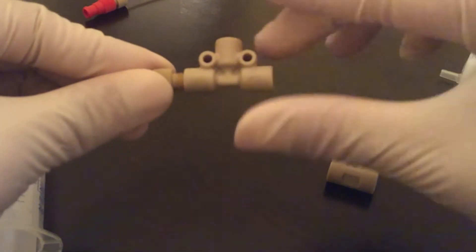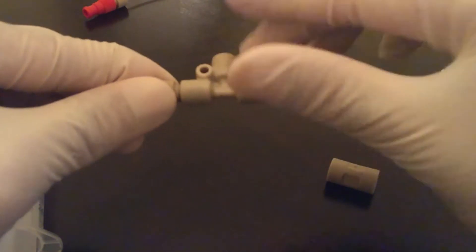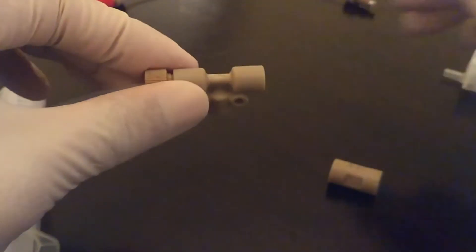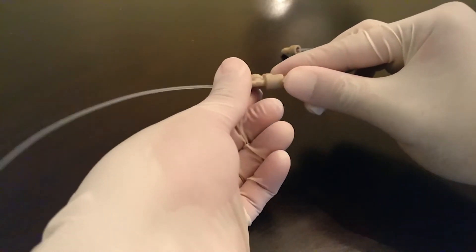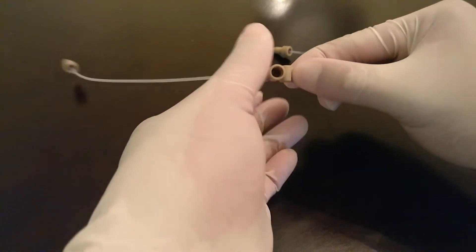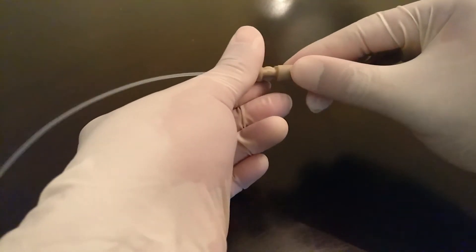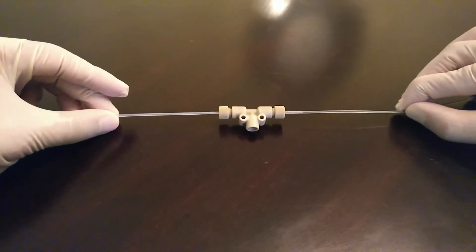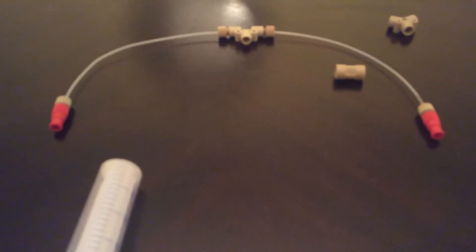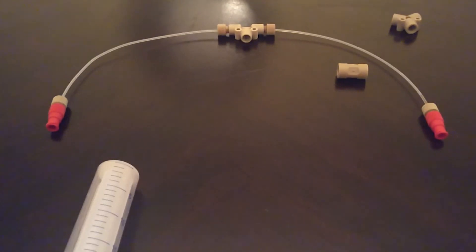Using the tubing connector already assembled in the previous step, simply screw these into the T-joint or the Y-joint. Finger tighten but do not strip the screw by tightening too hard. Make sure not to kink the tubing when you turn the joint.